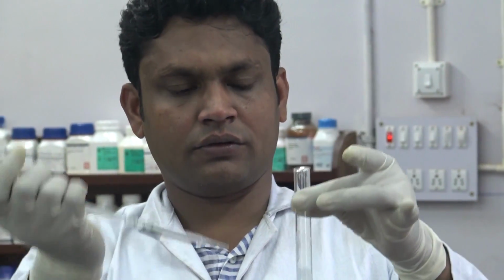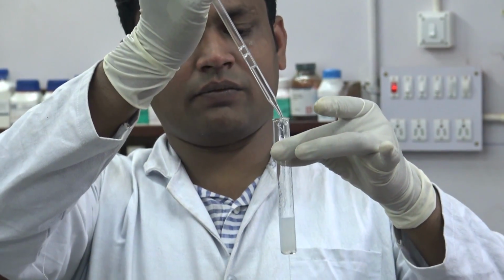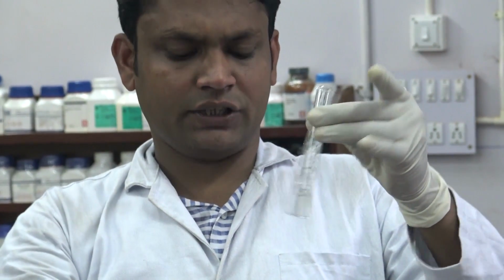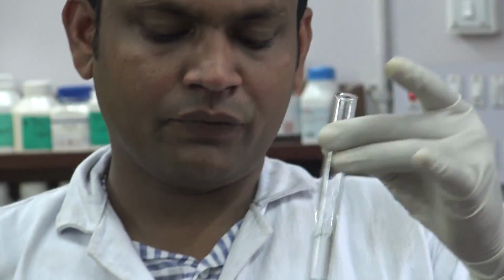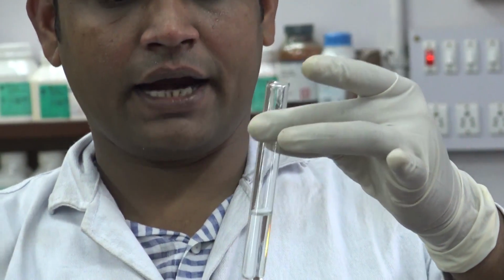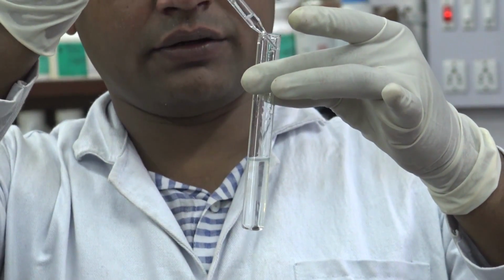After addition of slight NaOH, formation of gelatinous precipitate occurs. After addition of excess of sodium hydroxide solution, the precipitate dissolves. Then we will acidify the solution by adding acetic acid.